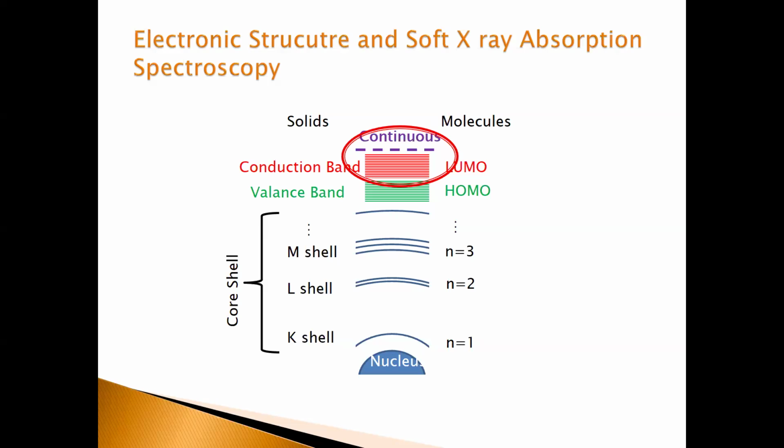And what is the efficiency of this? And if I'm doping with a lanthanide, what about fluorescence also? Can I measure fluorescence from my samples using X-ray absorption? Fluorescence in the visible range. I mean, it absorbs X-ray. Yeah, photoluminescence. It's absorbing the X-ray and giving a fluorescence in the visible range.